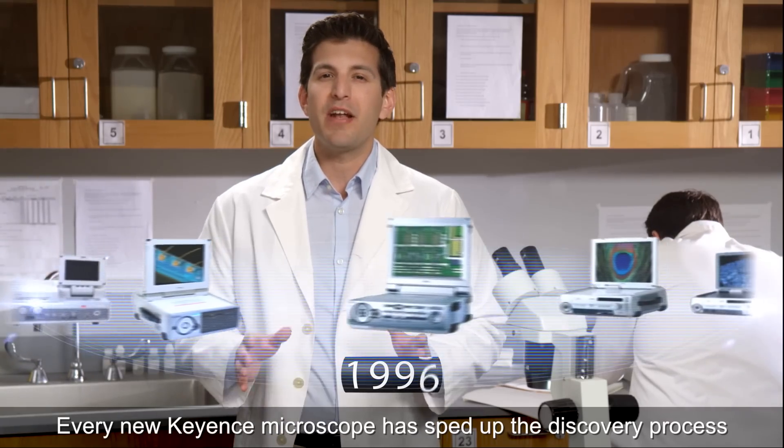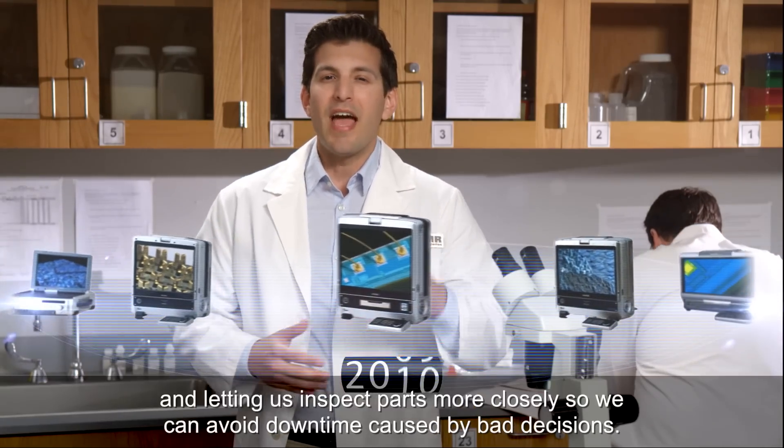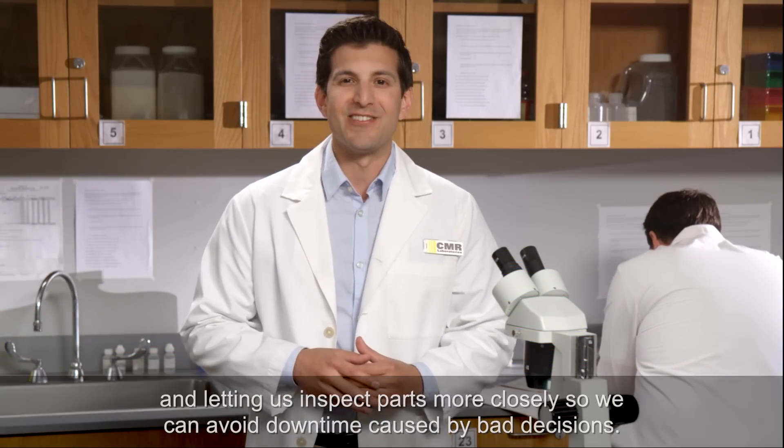Every new Keyence microscope has sped up the discovery process, taking the guesswork out of product development and letting us inspect parts more closely so we can avoid downtime caused by bad decisions.